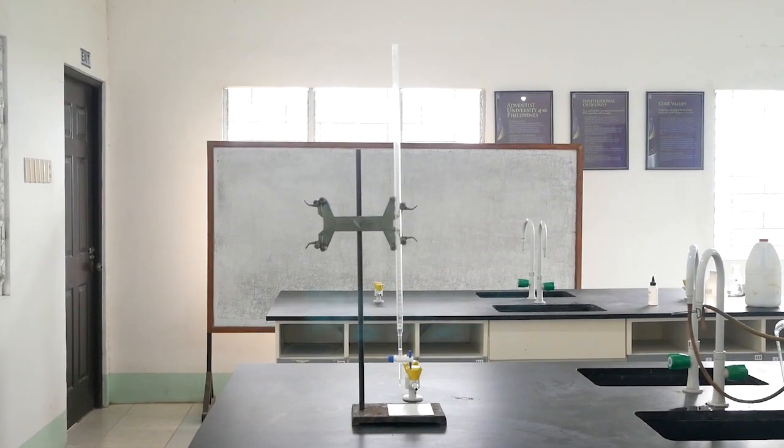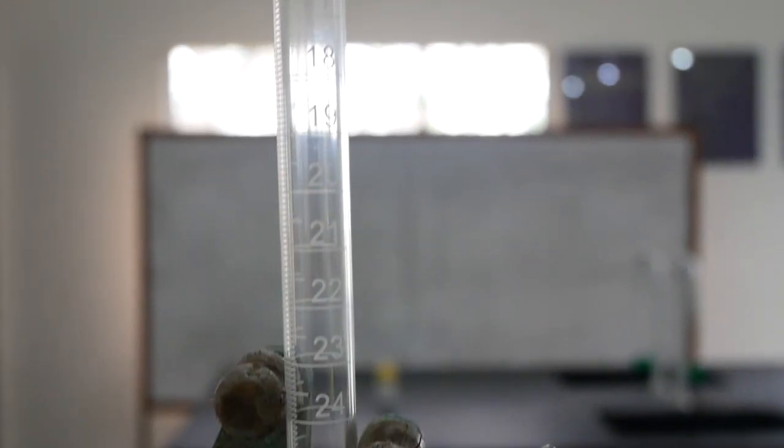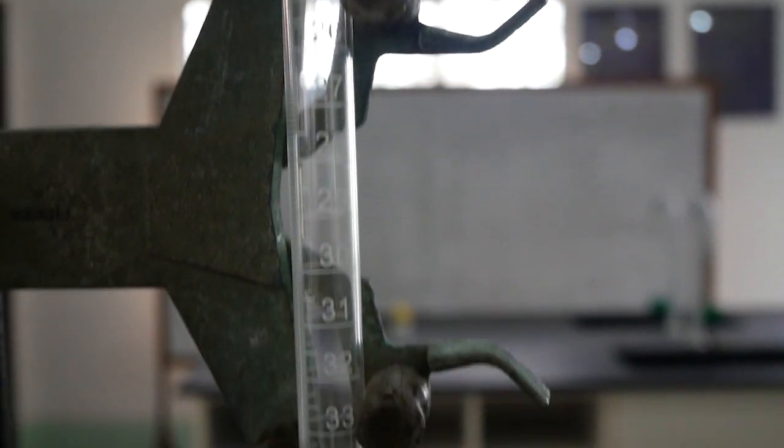So here again is the setup. Notice how the milliliter graduations on the burette start from zero at the top and increase as we go downwards to the bottom.